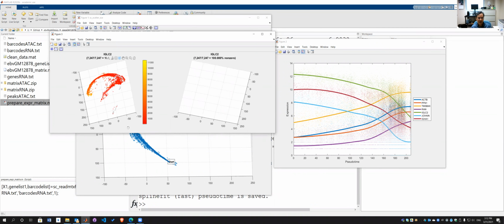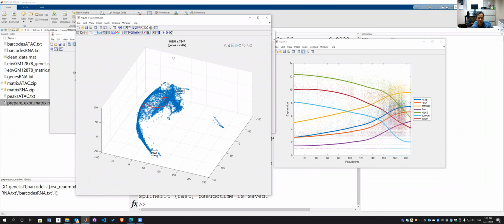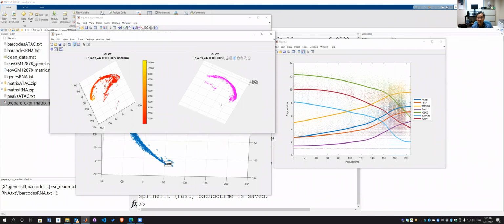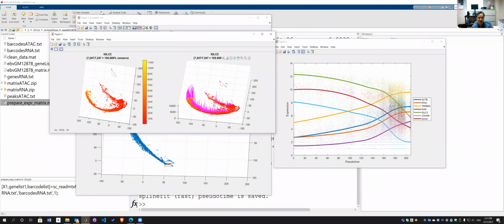Okay, so I can roughly conclude that this long branch arises because some of these types of genes drive the cells to look so different from other cells. So this IGLC is immunoglobulin, a constant chain maybe.